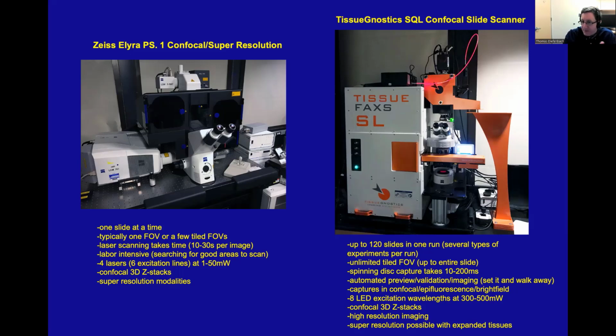Of course, being a spinning disc confocal system, it's very fast. You can do Z-stacks, and I was the first to show that you can use oil immersion on this, giving you automated oil immersion, say, of cell cultures, because all of the slide loading process is horizontal. So you can pre-add the oil drops to the slides and then it just autofocuses perfectly fine.